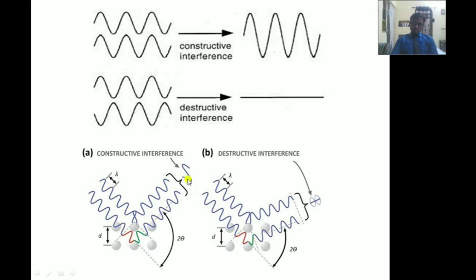Okay. So you should keep in mind that only constructive coherent interference is recorded by the X-ray detector, and the rest is not recorded because of destructive interference, because no waves are created in the output, like this figure shows. This is the constructive interference figure, and this is the destructive interference figure. See, they cancel out each other, but in the constructive case they produce a new reinforced, high-energy, high-intensity beam.